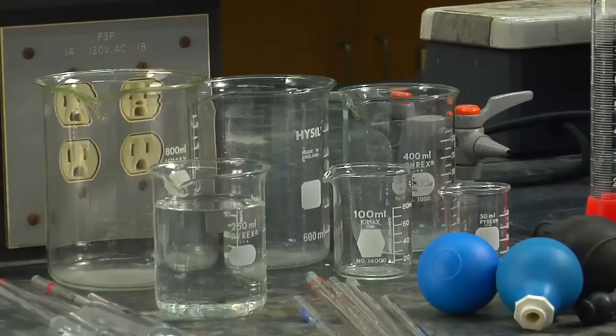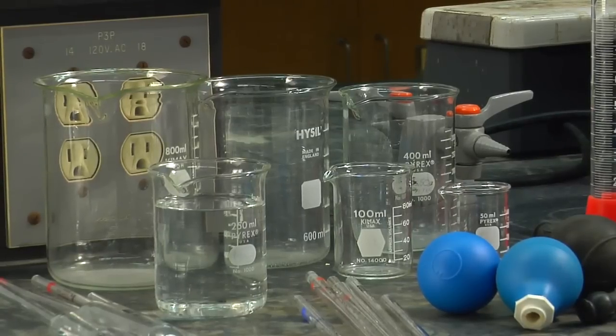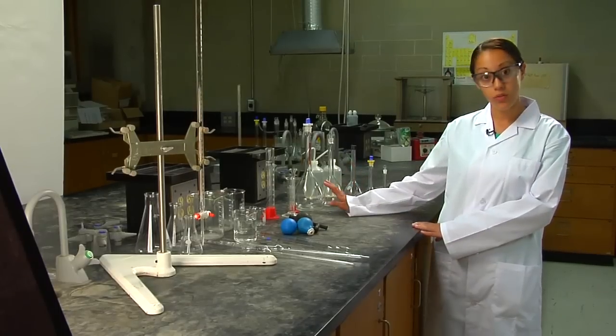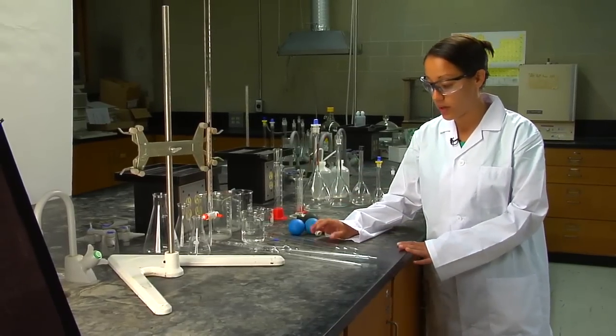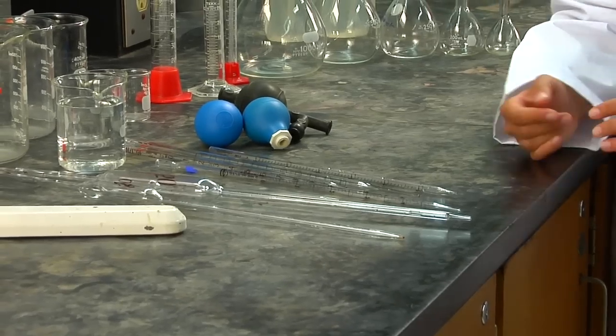Then you also have a range of beakers which are great for sampling if you want to transfer volumes into your volumetric flasks, and most importantly you have a lot of transfer pipettes for measuring volumes.